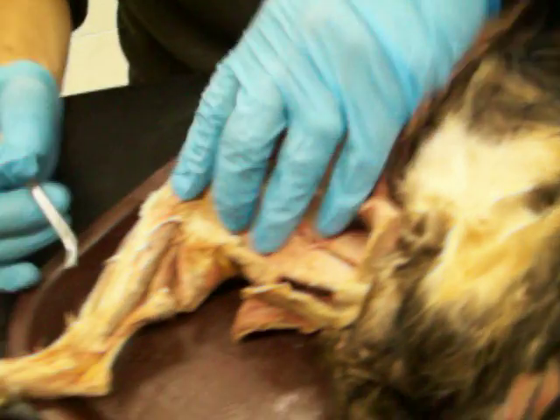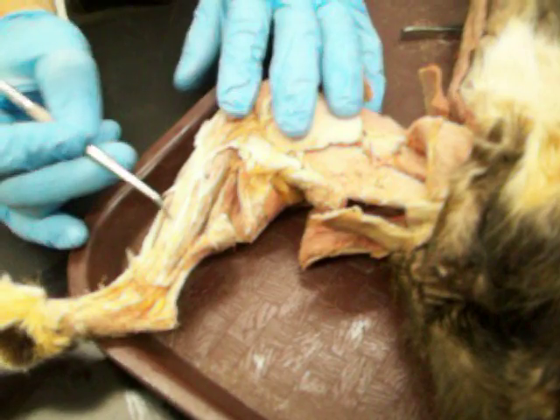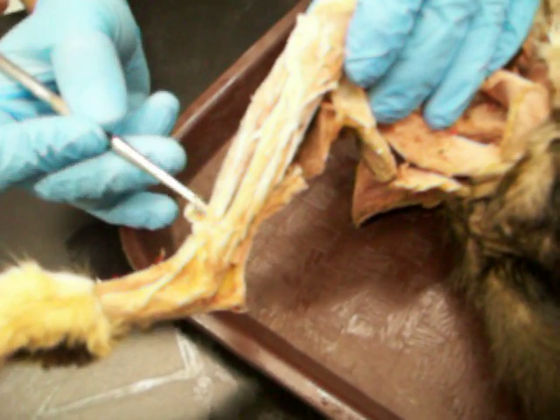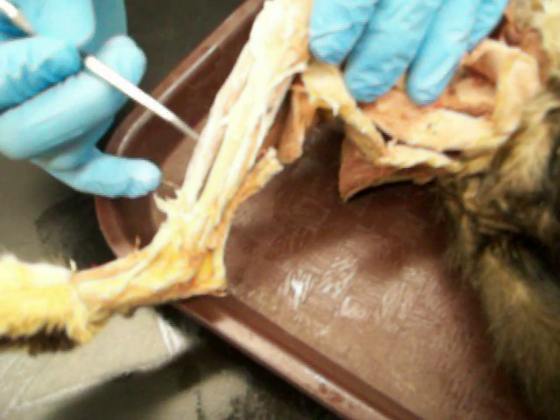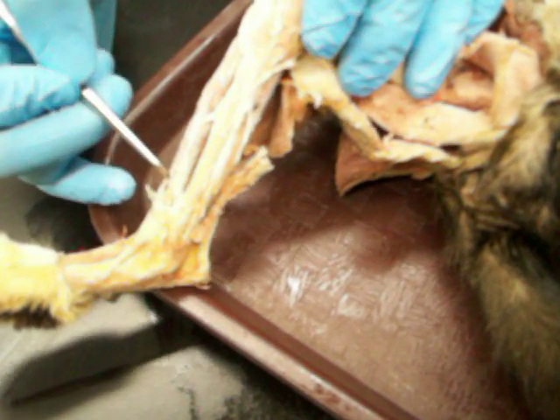On the front, here's the tibialis bone — the tibia — so there's the tibialis anterior, and there's the extensor digitorum longus. So: tibia, tibialis anterior, extensor digitorum longus right there.